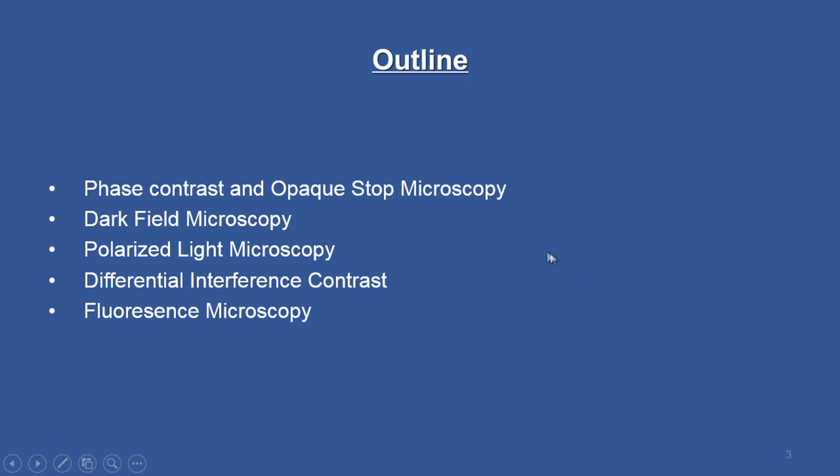I will be discussing the variants. I will start with phase contrast and its similar technique, opaque stop microscopy, and then dark field microscopy.